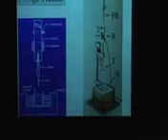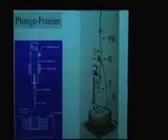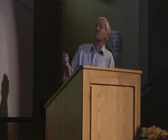These are very noisy projections. In order to get the molecules into this layer of ice, we use a so-called plunge freezer. This is a very simple device which can be hand-built, but there are, of course, very elaborate commercial versions available which can be computer operated and so forth.